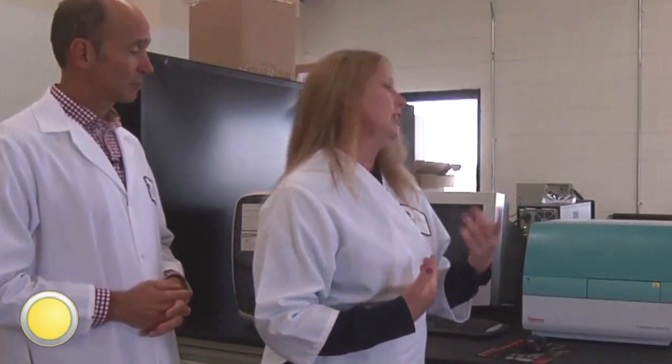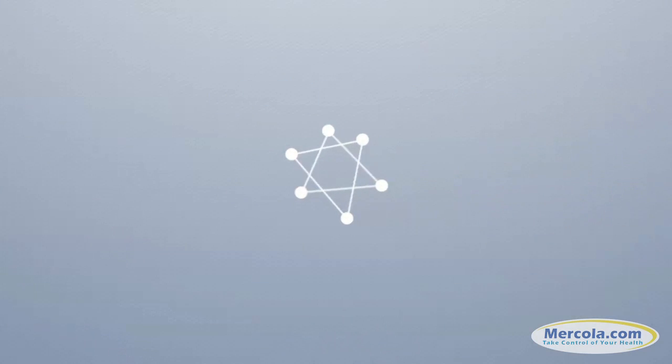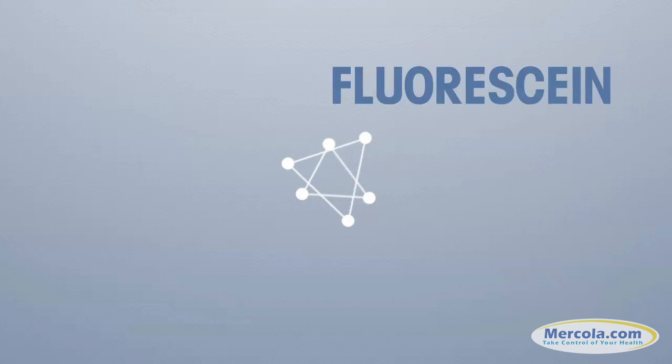Okay. So again, we do this on our raw materials when they come in, as well as the intermediate bulk and the final product bottles. This machine here uses these trays, and it is a fluorescence machine. So we actually make a solution with the powders using either acetone or ethanol. We add fluorescein to them, and then we also add another compound called AAPH. And that actually attacks the antioxidants. The fluorescein attaches to the antioxidants. So when the AAPH starts to break down the antioxidants, we can actually watch the maximum fluorescence drop down as the antioxidants break down. And those give us our curves where we calculate the value off of.